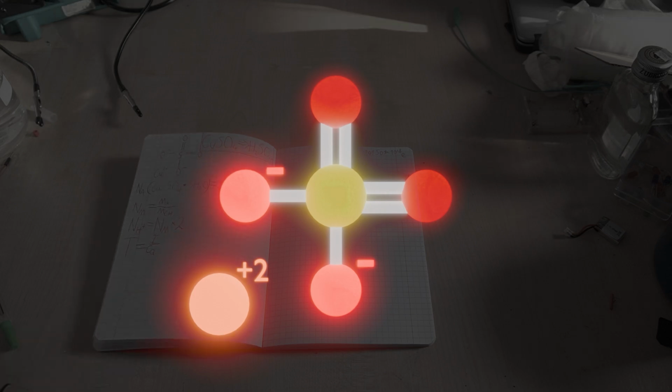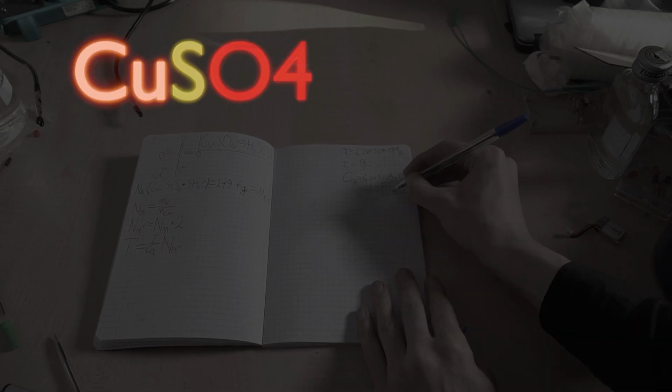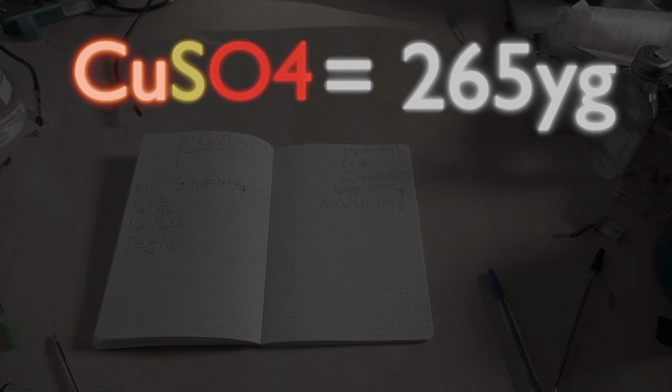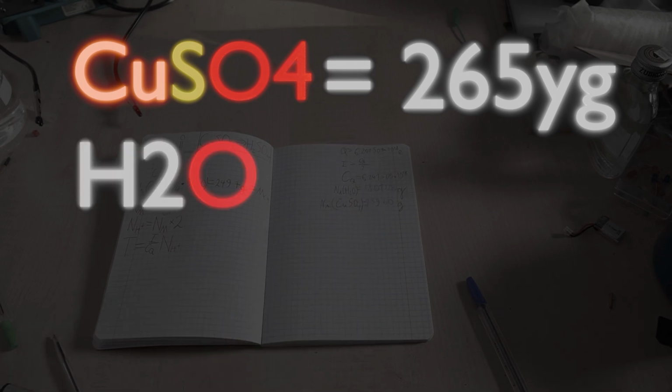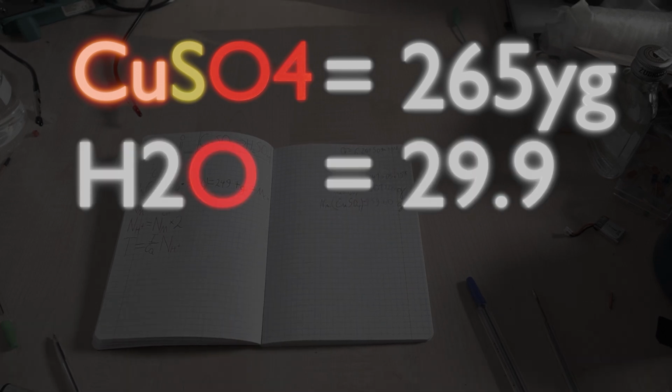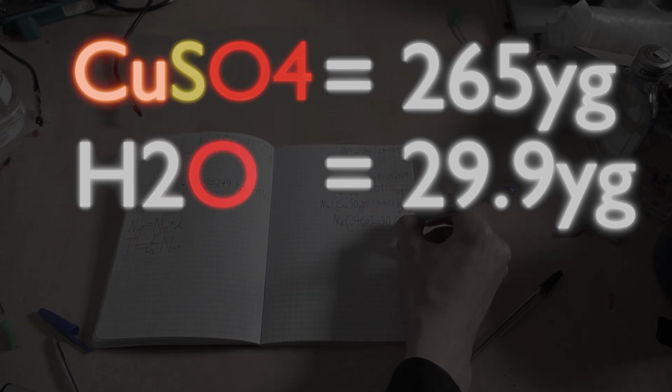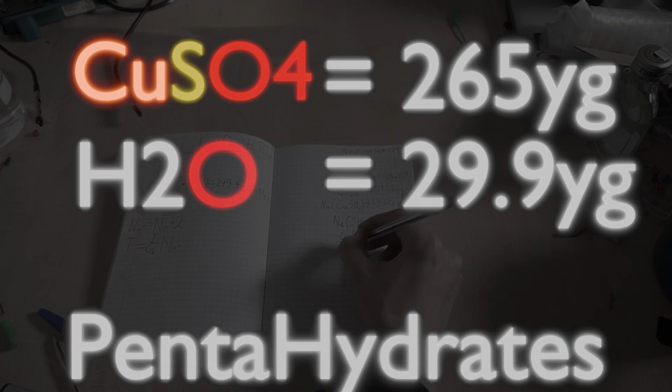Now, when we dissolve it in water, it forms copper sulfate pentahydrate, and what's really nice is that we can calculate exactly how much copper sulfate we need to dissolve. In order to calculate that, we just note down the mass of a single molecule of copper sulfate, which is around 265 yoctograms. Then we note down the mass of a single molecule of water, which is around 29.9 yoctograms. And we remember that for each copper sulfate molecule, we want 5 molecules of water, because pentahydrate, penta means 5.